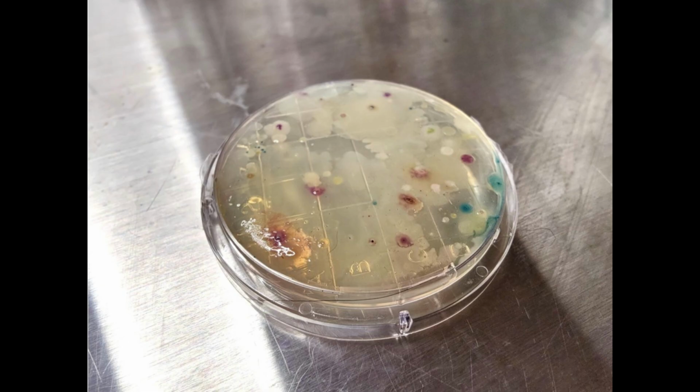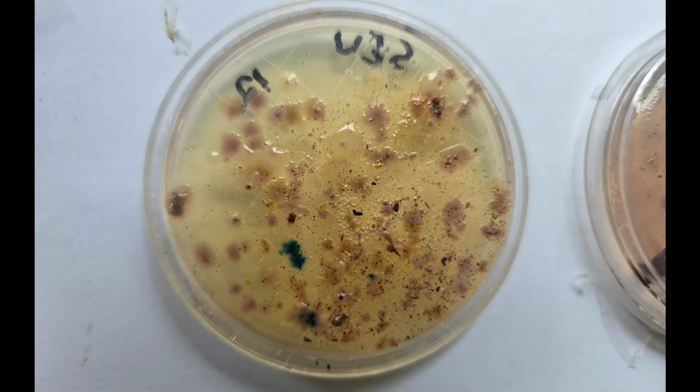Here's another plate. This one is from someone's house. It's from the back of their television, I think, if I remember correctly. And you see a whole bunch of red colonies and a couple of blue. This is not sewage. If you got this result back from a laboratory, they would say it was sewage because they had all these coliforms.